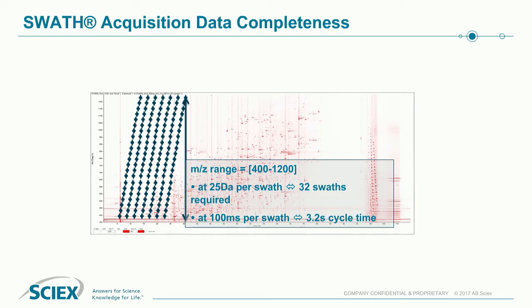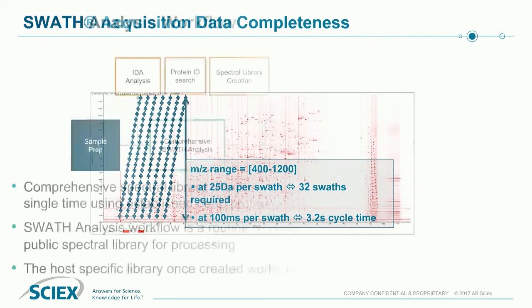We're able to then deconvolute these signals in the MS/MS that are generated from the peptides. These are used for the quantitation, and we're able to cover this whole mass range and offer MRM type of quantitation within the time that you have for elution of the compounds across the chromatography peak.